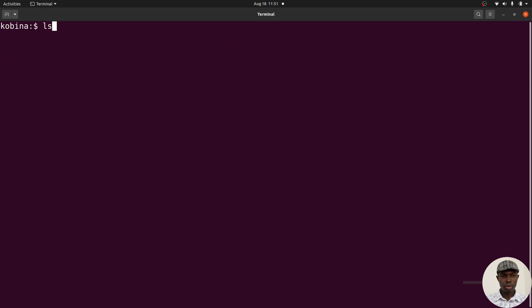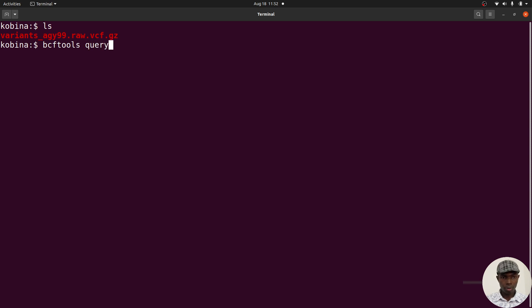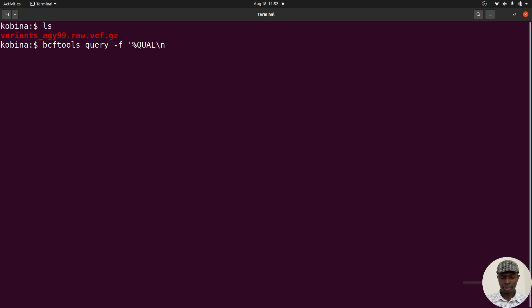The download is done — it's a small file. Running ls you'll find it there. Before we filter, let's do a small query to check that the quality field is populated. I'll use: bcftools query -f '%QUAL\n' followed by the filename. Let me refine that — bring the -f flag, open quotes, use the percent sign with QUAL, add a newline \n, close quotes, and supply the file. Let's execute this command.